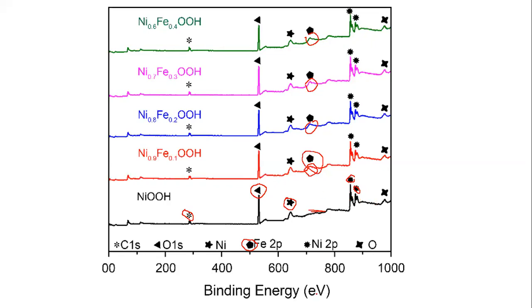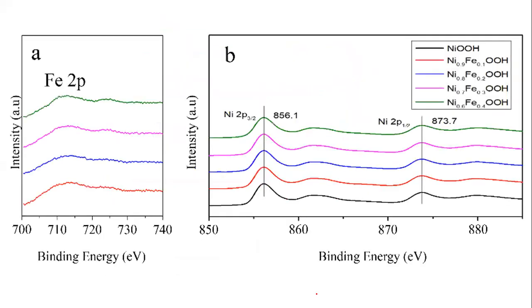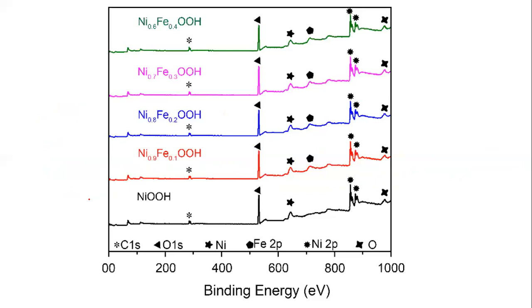If I want to zoom in a little bit, then how will it look? You can look here: this red color, that is blue, the pink one and the green one are the iron added spectra. I have zoomed because I'm just giving you a look. It started from a range from 0 to 1000.